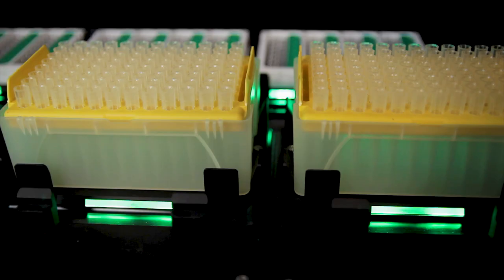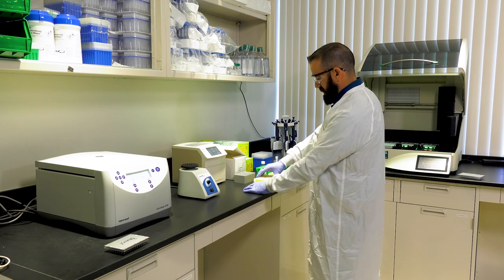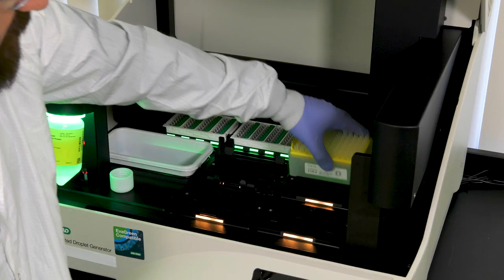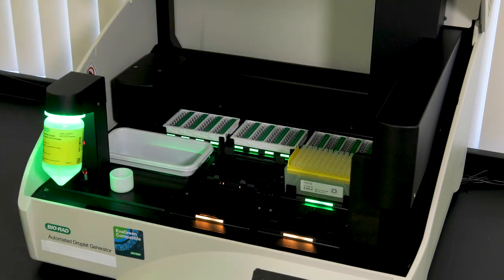Next, ensure that you are using DD-PCR tips that are specifically made for the automated droplet generator. Remove the cover of each tip box and place the tip box on the instrument. Simply load the tip boxes where the screen tells you to.